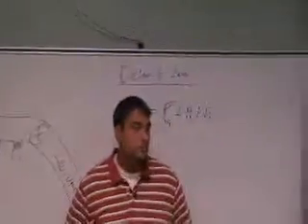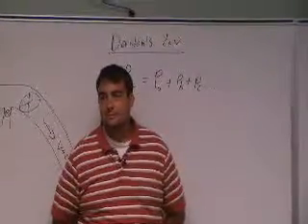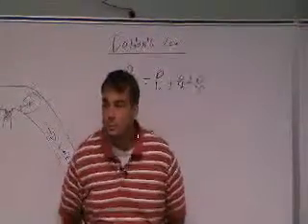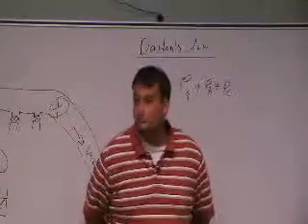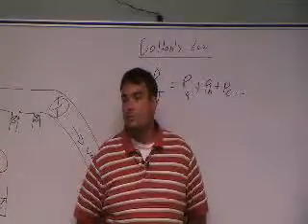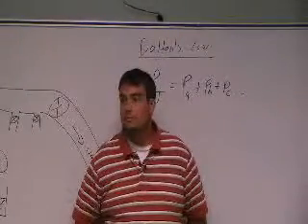I'm kind of curious about something. Have you ever had to use liquid nitrogen? Oh, yeah. Use it? Yeah, this is how you do it. Thousands. What can it really do? Thousands. What are you talking about? Could you take this pin, stick it in there, and it just break it down? Yeah.